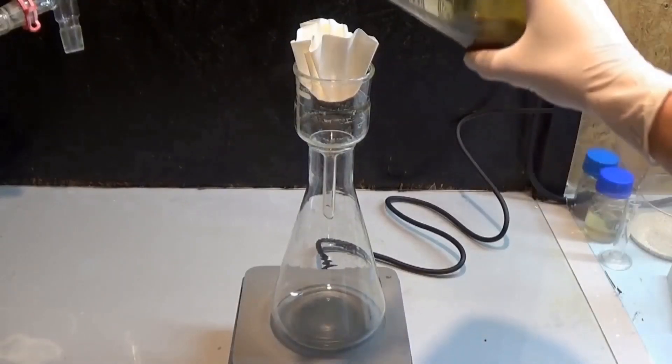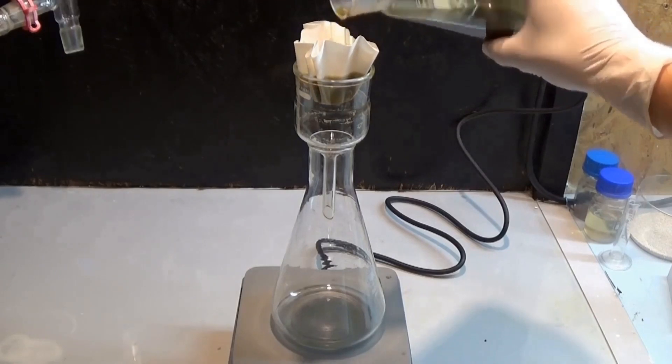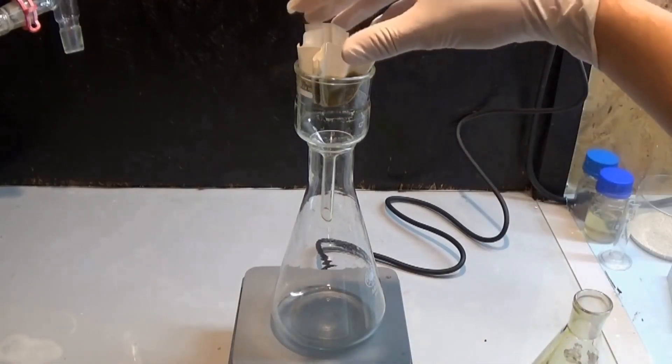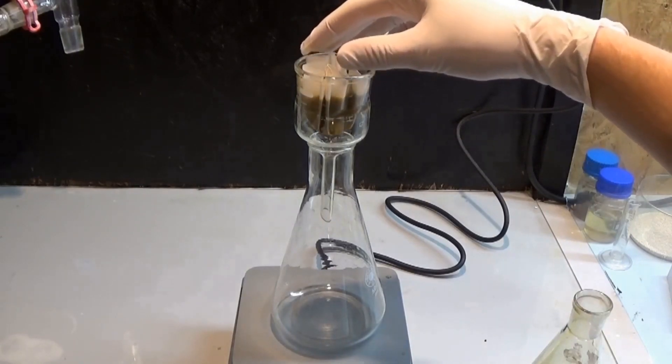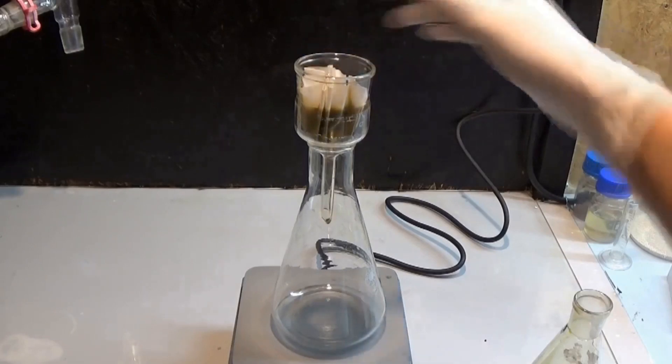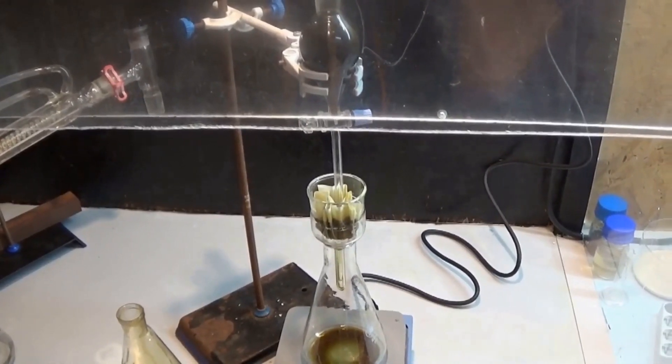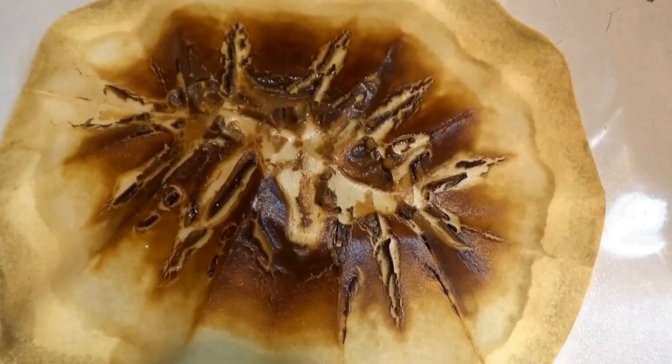If you have access to a vacuum filtration system, I have to warn you: do not use the glass filters for this step. The goopy mixture clogs them pretty bad and it's a pain to clean them out. I had to use hot tetrachloroethylene followed by chromic acid, which are both chemicals I don't really like to work with. But if you have a Buchner funnel, go for it and enjoy the time-saving luxury of a vacuum filtration system.